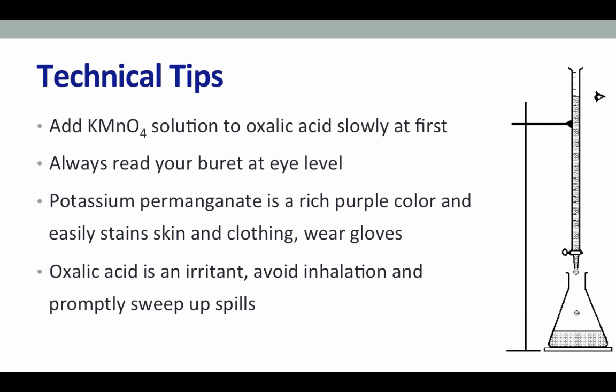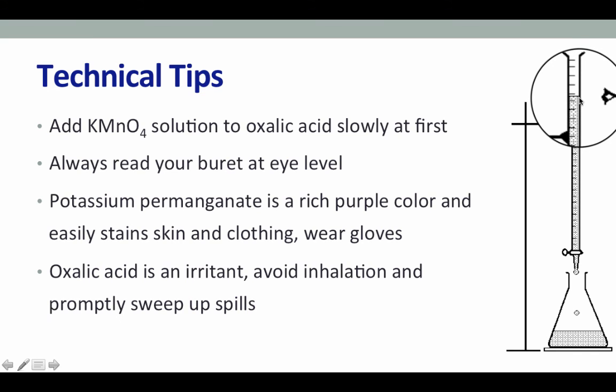With this specific redox reaction, it's important to add the potassium permanganate solution only very slowly at the beginning of your titration — this pertains to the first 3 to 5 mL. If you add the permanganate solution too quickly at the beginning, you will end up forming manganese oxide, a brown solid that will precipitate and ruin your titration. It's also important to always read the level of your burette with your eye at the level of the liquid. Potassium permanganate is a rich purple color and easily stains skin and clothing, so wear gloves and button up your lab coat. Oxalic acid is an irritant, so avoid breathing any of its dust and promptly clean up any spills.